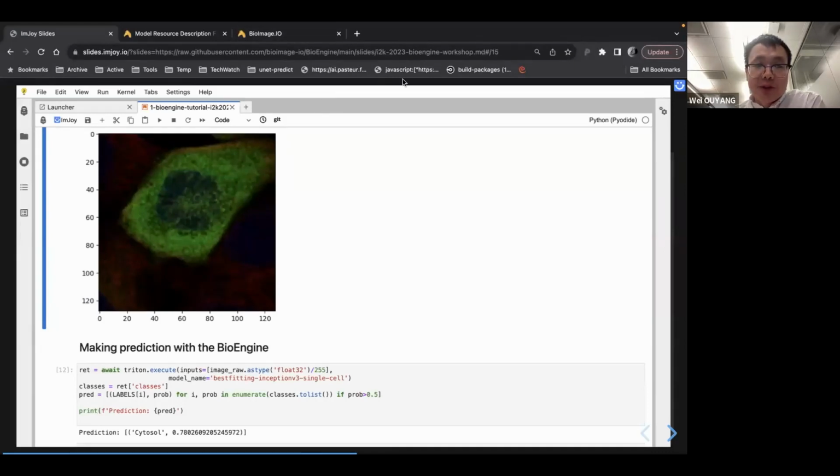Let's see. Did you manage to run these models in the notebook? If yes, could you raise your hand, for example, just to get some feedback and some idea whether you have successfully run the models. Yeah, only one. Okay, cool. If anyone else wants any help with that, feel free to chat.